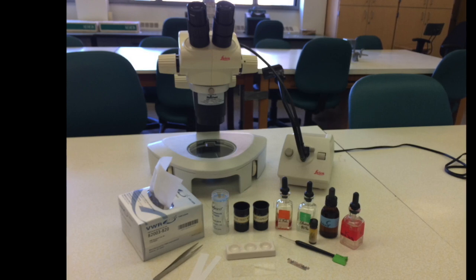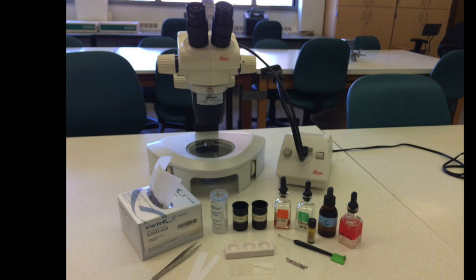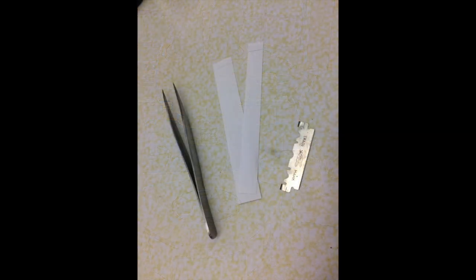Now that we've learned all about the chemical reagents, let's look at some other supplies you might find handy while performing your spot tests. A dissecting scope is especially handy while working with small samples. Forceps, scrap pieces of paper, and a razor blade are also necessary.